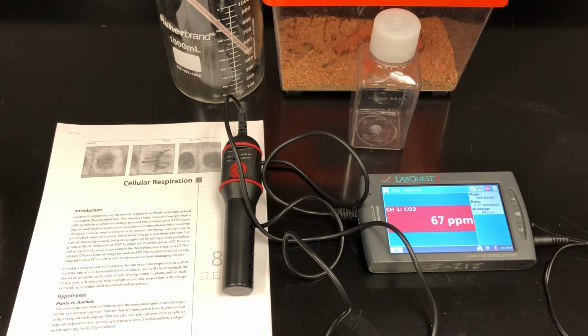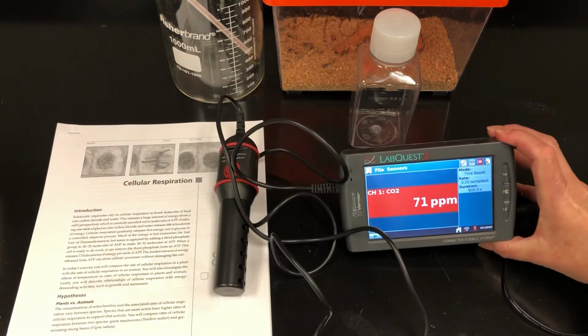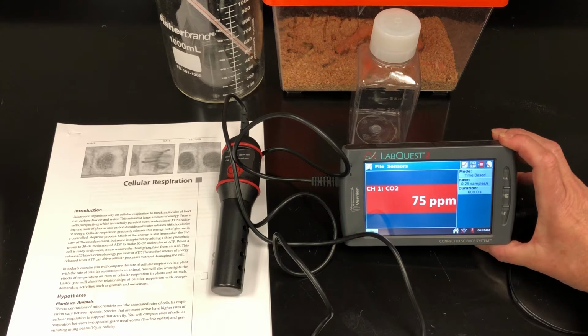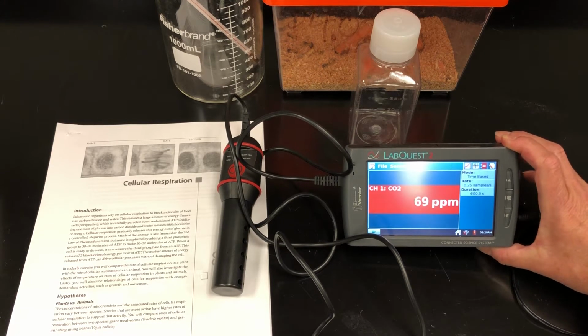So in the cellular respiration lab, we're using these little handheld computers basically. They're called LabQuest units. You may have used them at the high school level. We've had them for a couple of years. And you can see that it's measuring CO2 right now, and the numbers are all over the place. The reason is that this is a ventilated room. There are fans all over the place blowing the air around.